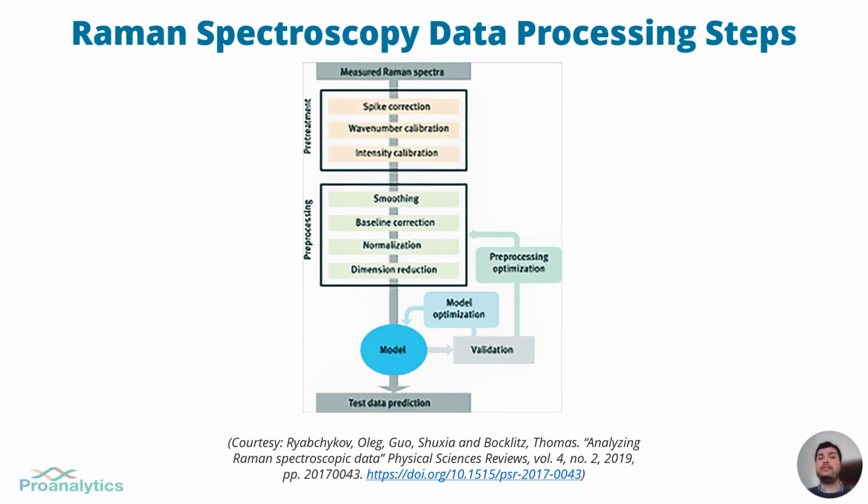Then the calibration and validation sets are created from the experimental data. Root mean square error on the calibration data and root mean square error on the prediction data are important parameters to check the validity of the model that is built. Minimizing these errors with the created model is the goal. Partial least squares, principal component analysis, artificial neural networks, and net analyte signal algorithms are commonly employed for the predictions. The model is optimized and pre-processing is cross-validated through the validation dataset, and at the end, spectra are predicted from the unknown data.